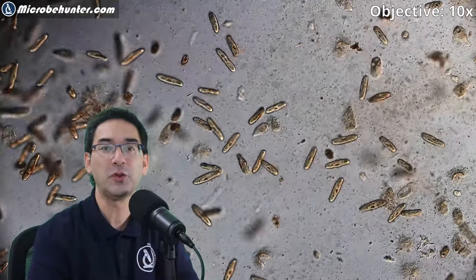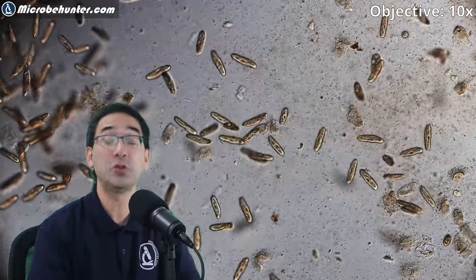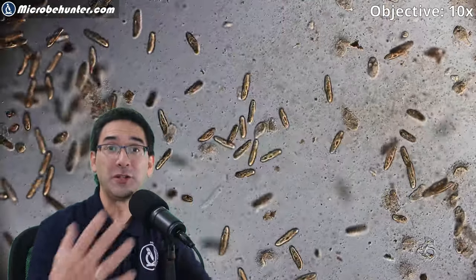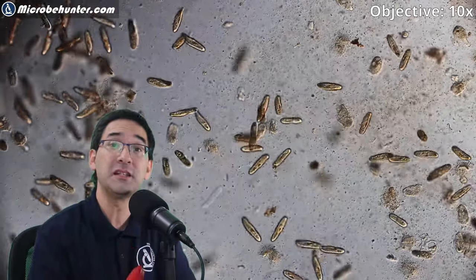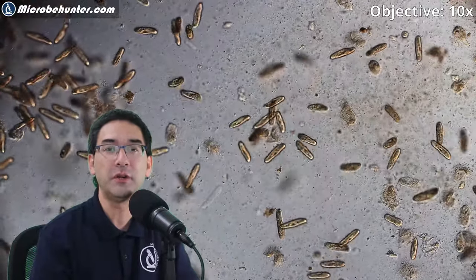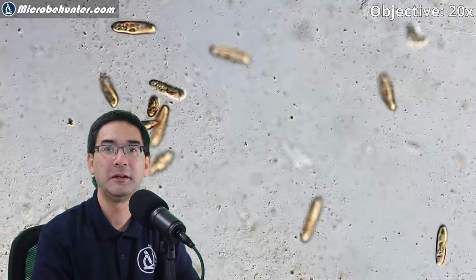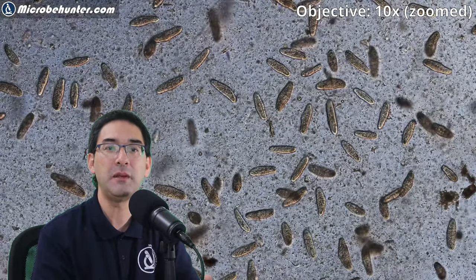I wonder why the rotation direction differs, and it's interesting to see how the response varies depending on concentration. At too high a concentration they stop moving right away, and you can see that some of the cells actually popped open and spilled their cell contents. It's quite interesting to see the effect of natural disinfecting substances on microorganisms. If you look carefully, you can also see that they change shape a little bit and start to lose water.